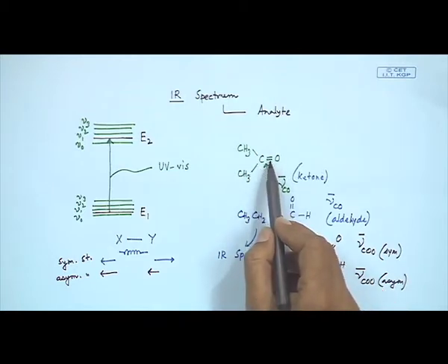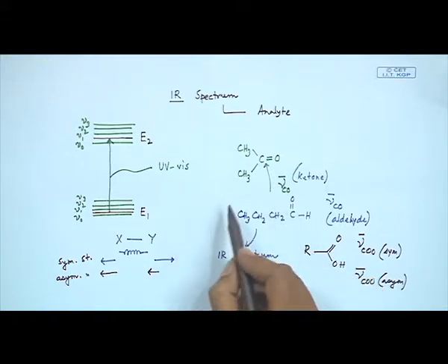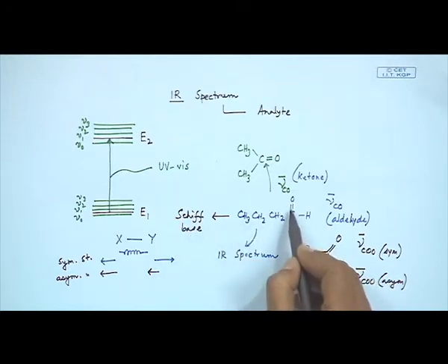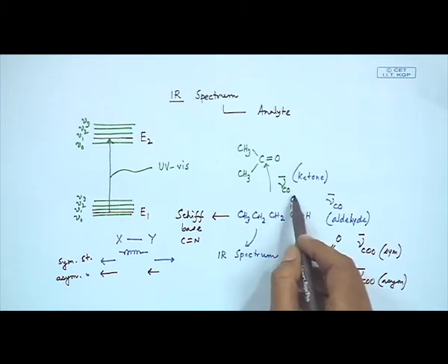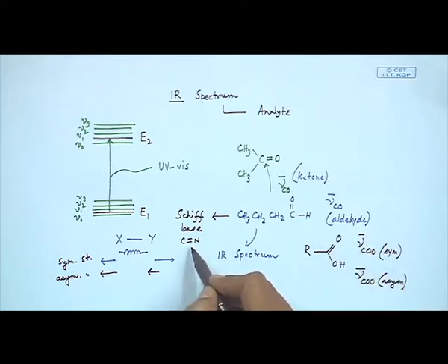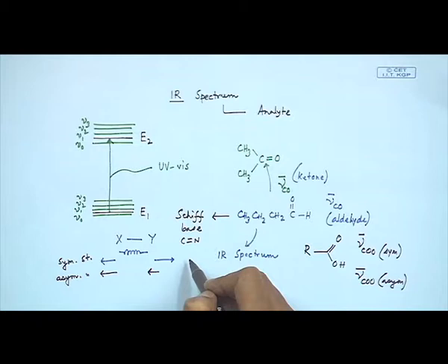Whenever we have this carbonyl function or this aldehyde function, we know that we can modify them for other reactions like our corresponding condensation, which we can consider as the Schiff base condensation, where the C double bond O bond is converted to imine function. So, you see that there is a change, that means CO function is going to CN function. So, aldehyde is going to imine, and therefore the amount of energy which will be absorbed by these molecules will be different.